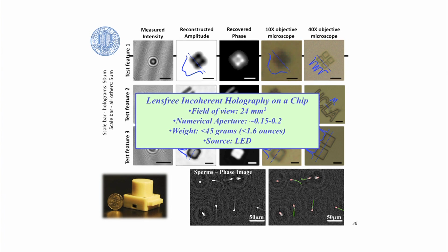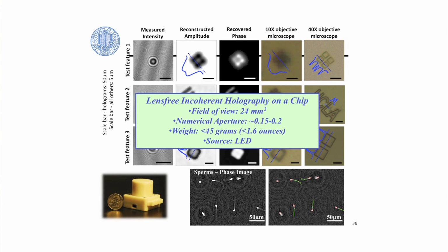The nice thing about lens-free imaging is the CMOS active area, whatever it is, is your imaging field of view. Typically, your cell phones have 20 to 30 millimeters square, and next year maybe they will be 40 millimeters square. That's the area where you can image a specimen with a decent resolution. In that regard, the real advantage here is the large volume, the large depth of field, large field of view that these microscopes can screen for. And quite useful for, again, looking for rare events, whether it's an E. coli particle or a cell in the sample.